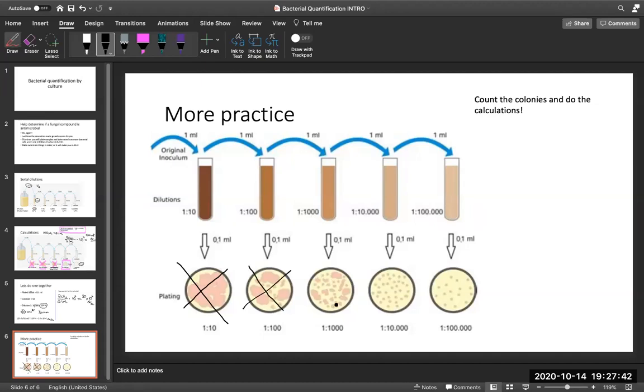And now I want you to use your judgment to tell me about this plate, and this plate. Okay. So I'm not going to give you the answer here. I can give it to you next week after it's due, but I'm giving you the opportunity to get 1 bonus point by doing this on the homework. Okay. So I'm not going to give you the answer yet.